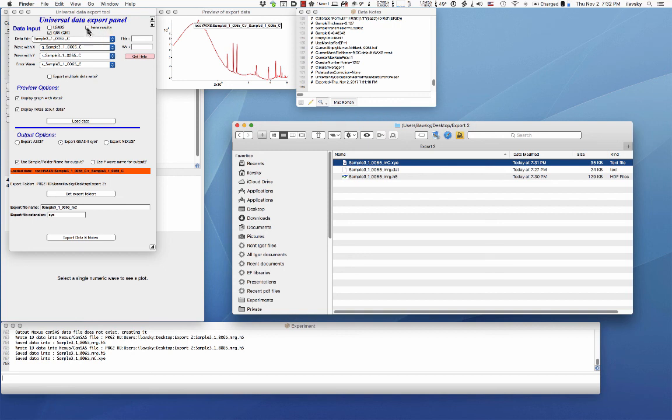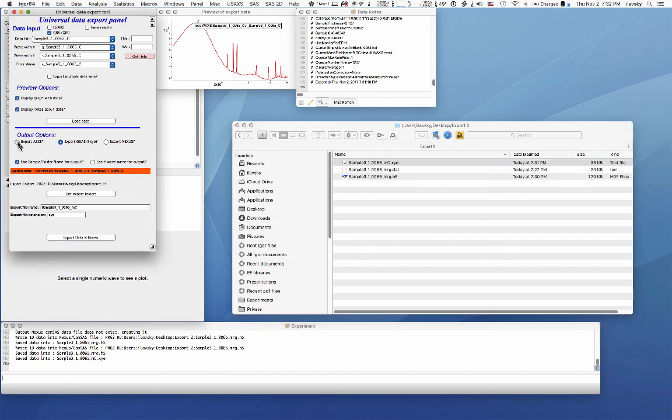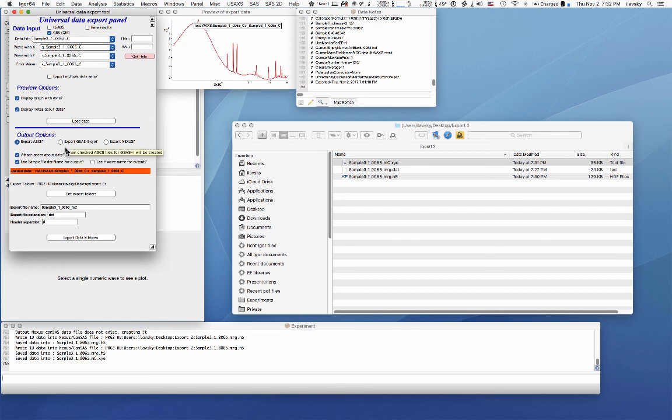If you have IRENA results and want to just stick them inside your favorite plotting package, you would use IRENA results and export them as ASCII, with or without the notes about data your choice. If you want to use powder diffraction, then you probably want to export as GSAS-2. And that's just about it.